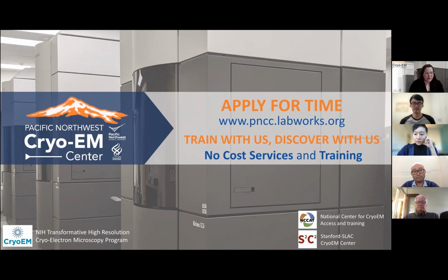We do have 5 scopes. We have 1 Arctica with a K3 and fringe-free, a Krios with Falcon 3, K3 and fringe-free, and then 2 Krioses with Falcon 3, BioQuantum, and then 1 Krios with Falcon 4, BioContinuum, K3, and fringe-free. So for sample preparation, we do have a Vitrobot and Leica GP2. We are still unfortunately undergoing validation on the VitroJet before we offer that to users.